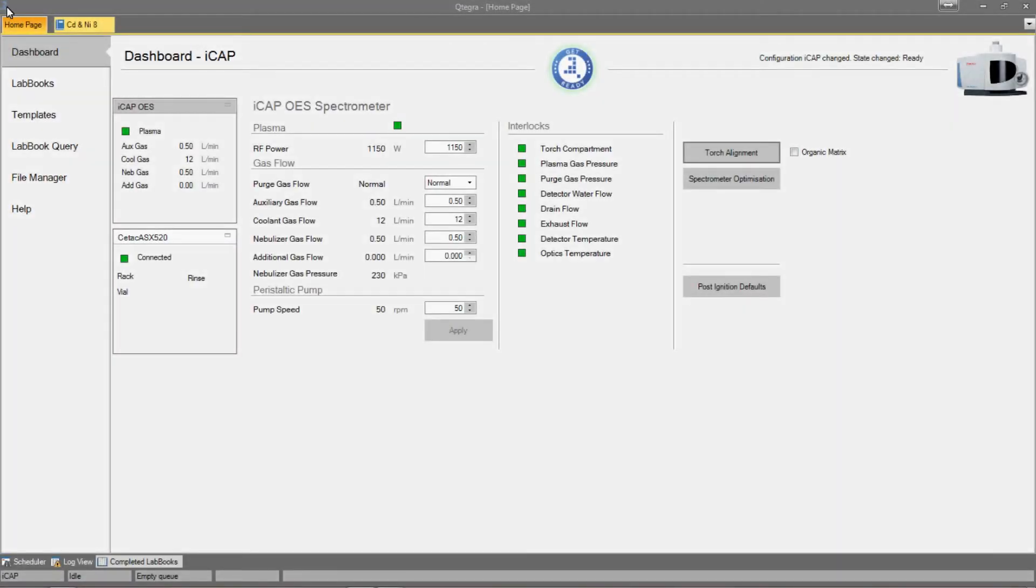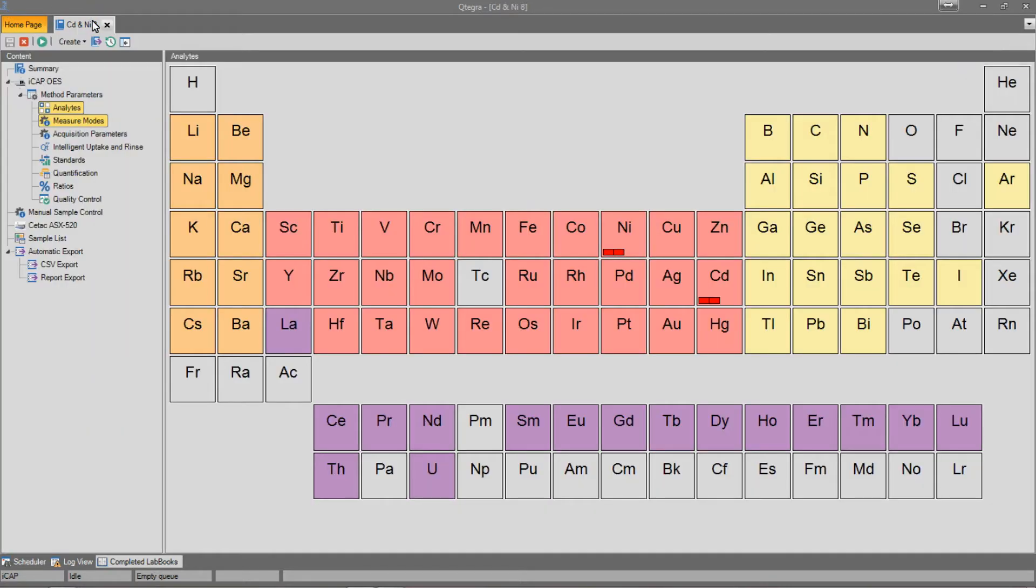This video explains how to generate and use full-frame images in Qtegra v2.2 for ICP-OES. To set up the use of full-frame images within a labbook, start by going to Measure Modes.